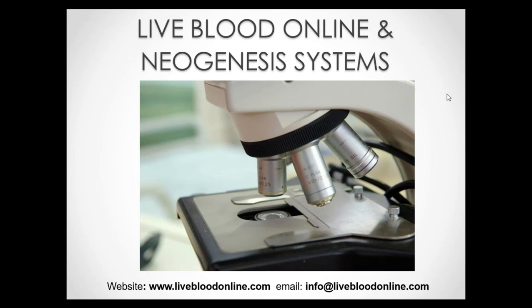So just for those of you who are not familiar with live blood analysis, it is also known as live blood cell analysis, nutritional microscopy, and the oxidative stress test. Live blood analysis is the observation of live blood cells using a high-powered specialized microscope that projects the picture of the live blood cells onto a screen, which is seen by the practitioner and the client together. A tiny pinprick of blood is put onto a glass slide, and then this is what's viewed on the screen. In live blood analysis, the blood is not dried or stained beforehand, as in medical blood tests.